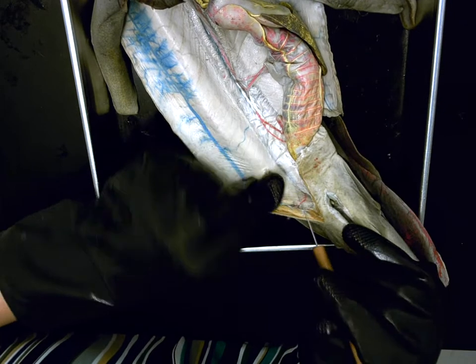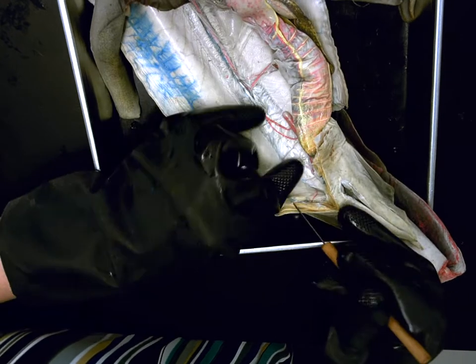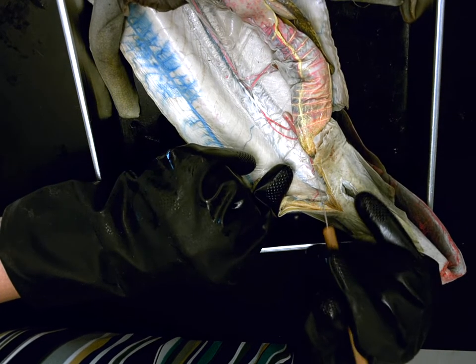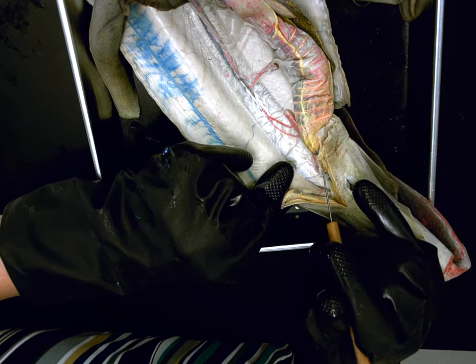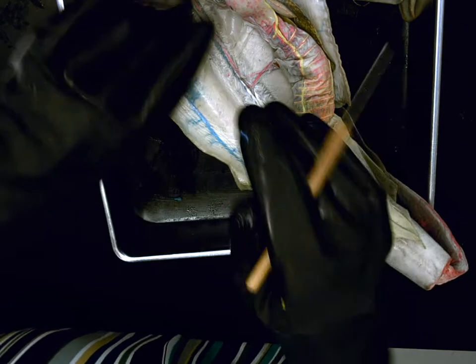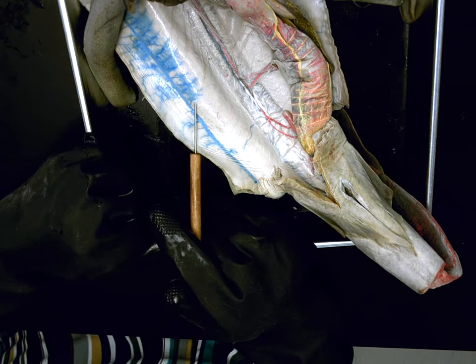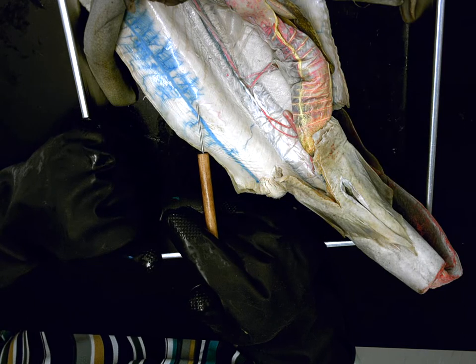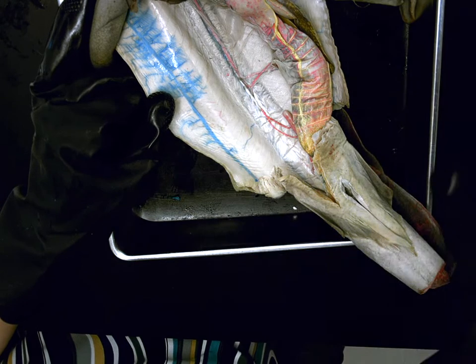All right. If I open this up, Adriana, what's this tough kind of white stuff here that would be built into the wall? Keith? Pelvic girdle. Pelvic girdle function. To help keep the pelvic fins in place. Excellent. Then if I go to this shiny wall, what would be the name, Shervin, of that shiny membrane? Peritoneum. Function. Ben, help him out. It covers the wall. Excellent. Lines the wall or coelom.